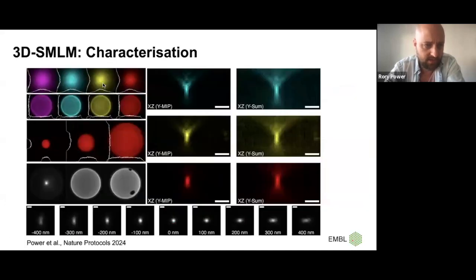I did a lot of other characterization here. You can see at the top left, this is the beam shaper, also measuring beam profiles before and after the beam shaper. You see the Gaussian input and the flattened profile afterwards. Below that, the variable illumination field of view. Then you see the back focal plane images of the objective showing the presence of bubbles, which is very helpful. Lots of other stuff.